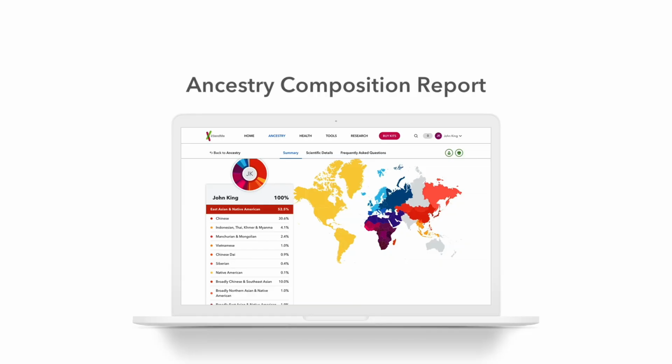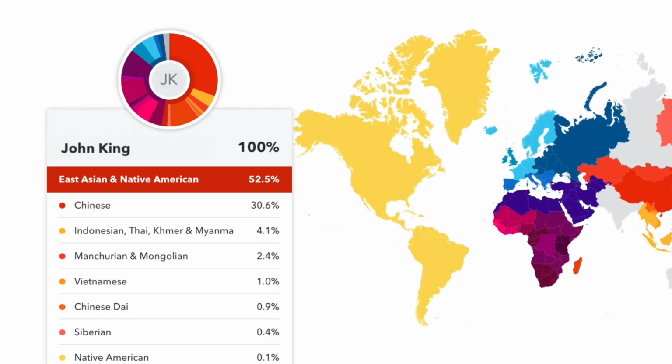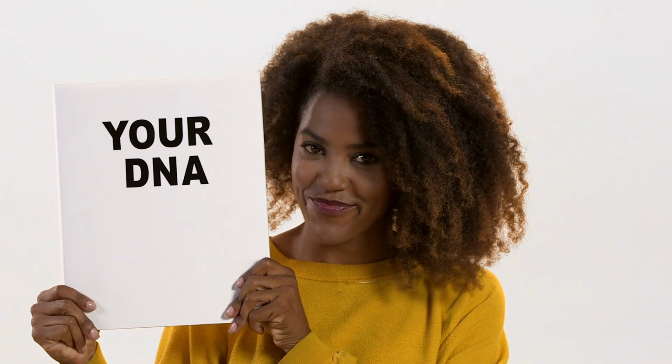And today, we get to the headliner of the show, Genotyping. Genotyping is how we figure out things like your ancestry composition and genetic health risks from your DNA. How do we do it? We read your DNA like a book. But we don't actually read every single line of the billions of DNA letters in your genetic code.